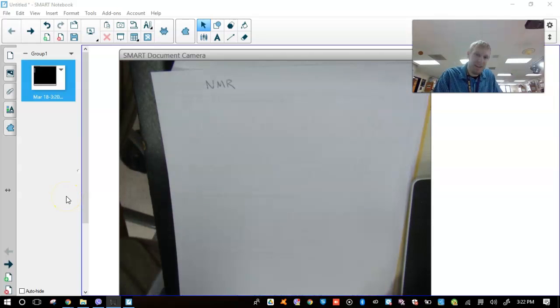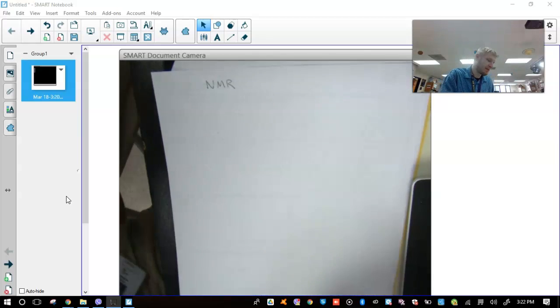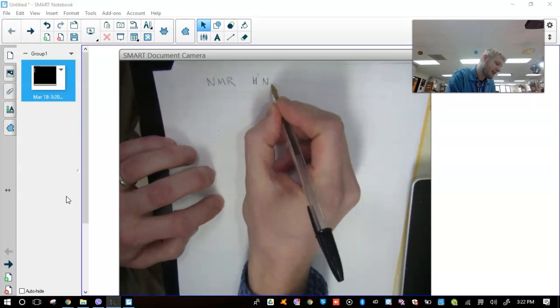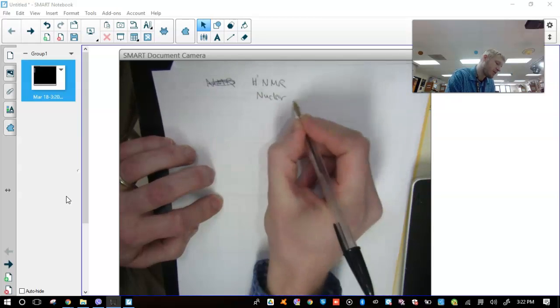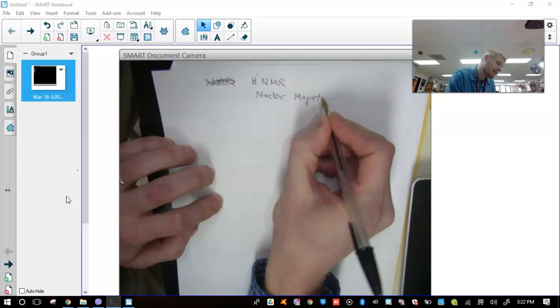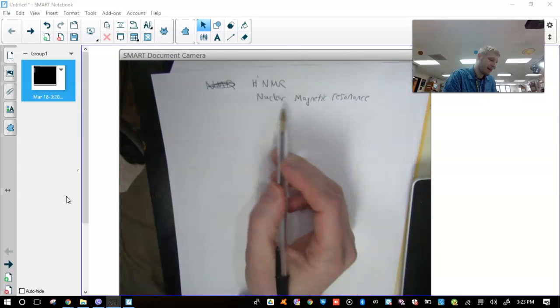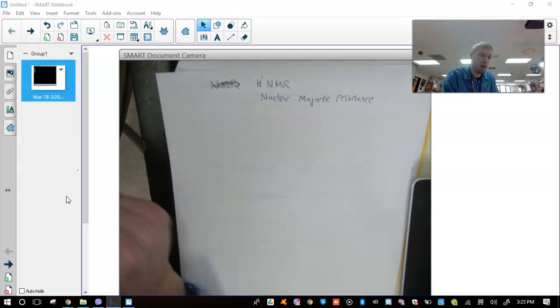Hello, this is Mr. Huebner, and in this video we're going to be talking about NMR, specifically HNMR, which stands for Hydrogen Nuclear Magnetic Resonance. So we'll just write that down. HNMR is nuclear magnetic resonance, and it basically summarizes the whole idea of what we're doing.